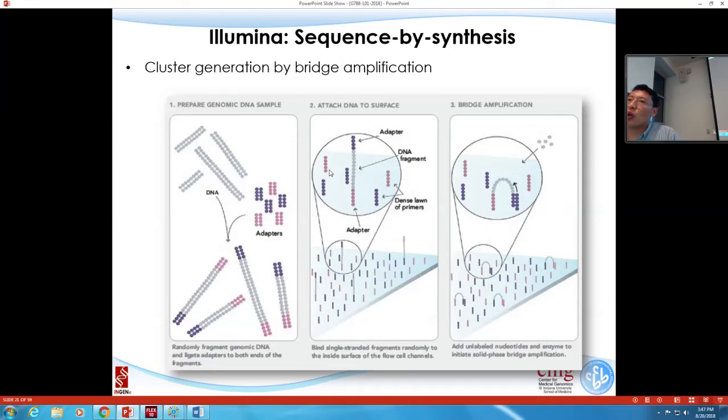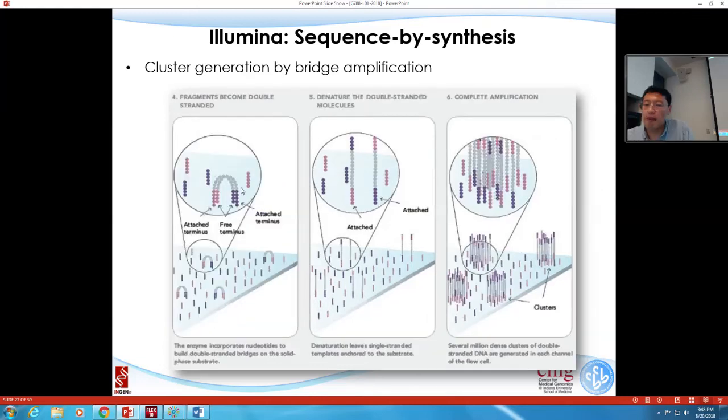That comes to the first important part of DNA sequencing, which is the amplification. The reason is that for each DNA molecule, the signal is too small, so we cannot reliably detect it. Therefore, we have to do amplification. The way we do that in Illumina technology is called bridge amplification. Each of the trees standing there can bend over and bind to the reverse complement on another piece of grass, and this forms a bridge. Once it's formed, you can use the polymerase to amplify the original DNA molecule based on the template. After doing that, one will become two, and then you make them stand again, bend again, and synthesize again.